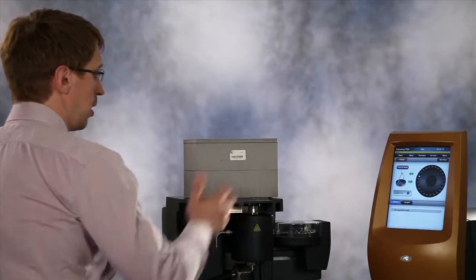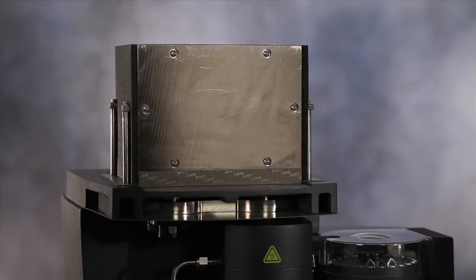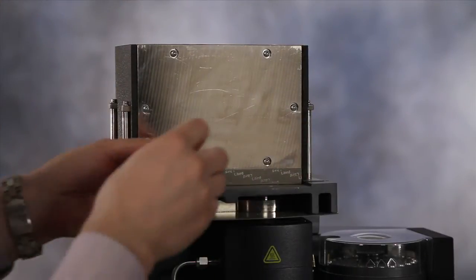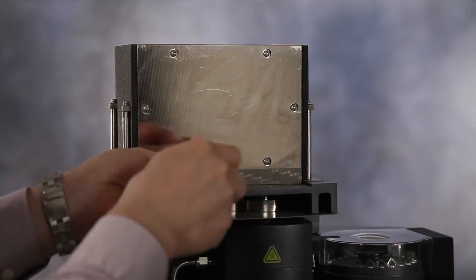We'll remove the insulation jacket, and then we need to remove the front plate by unscrewing six screws in front.